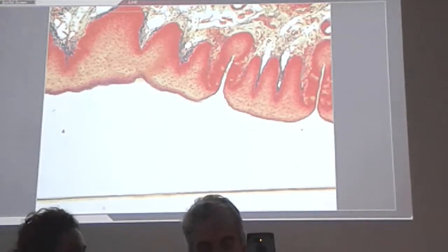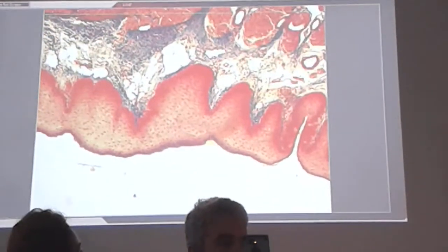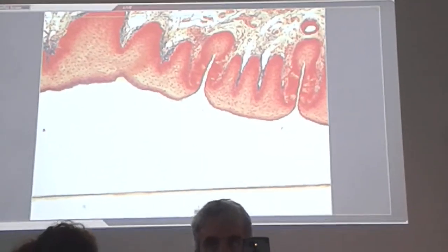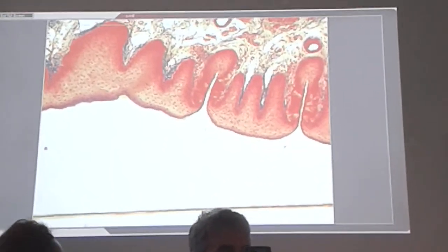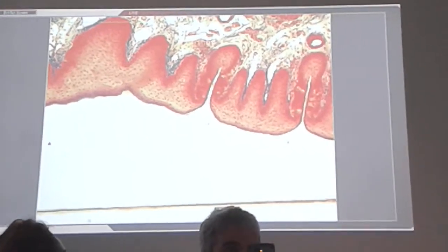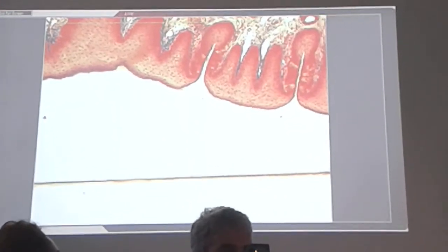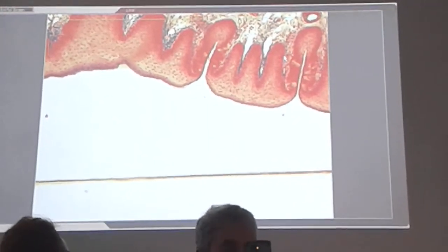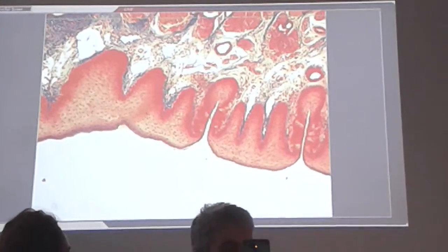So, how do we recognize this papilla structure? We can easily recognize that the papilla structure is still resting over the mucosal surface. But as I told you, the lamina propria and the submucosa are making invasions through the epithelia. Still, we have a continuous basal lamina of the epithelia. This basal lamina is clearly seen with the bluish, greenish color belonging to this histological preparation.